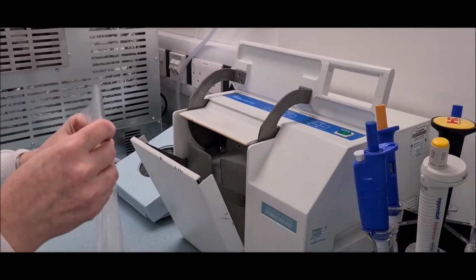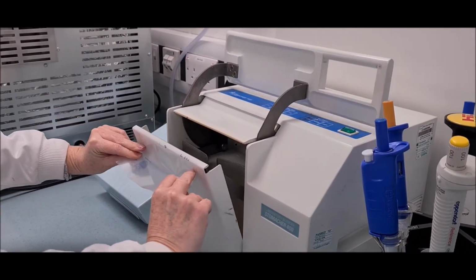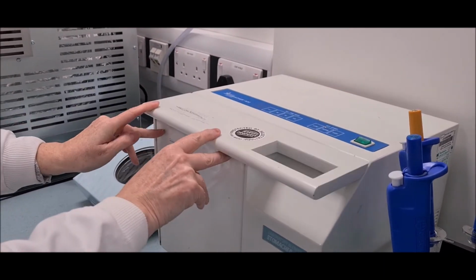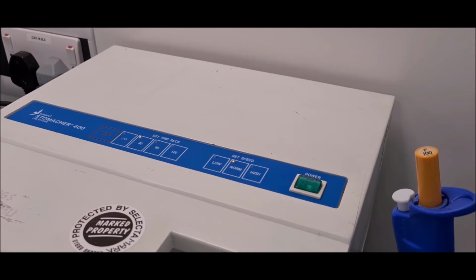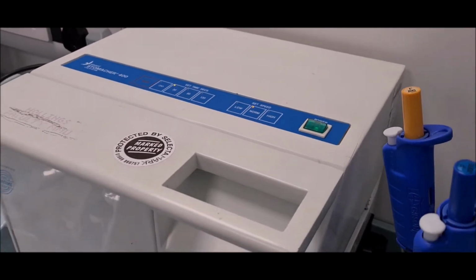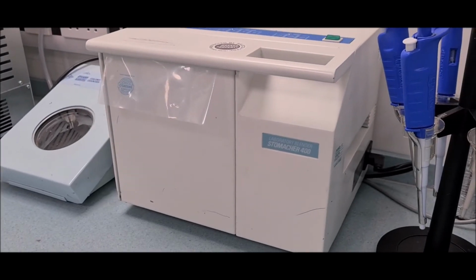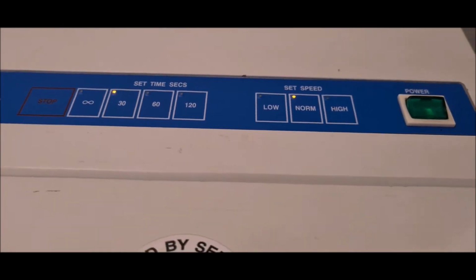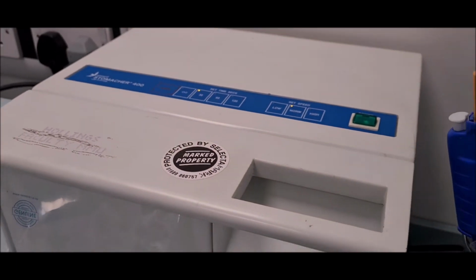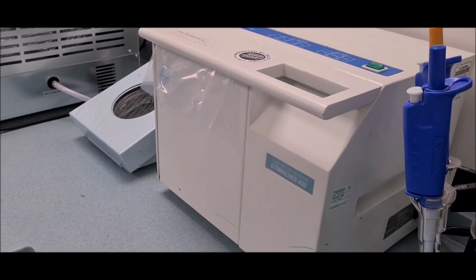4. Stomach for 30 seconds to 1 minute in the stomacher machine. This becomes your starting dilution of 10 to the power minus 1. The stomacher machine is made of 2 metal paddles that beat against the sample in the bag, homogenizing it and releasing microorganisms into solution.